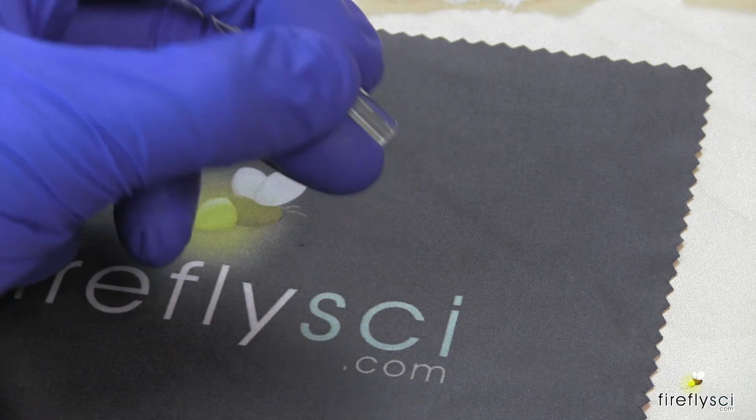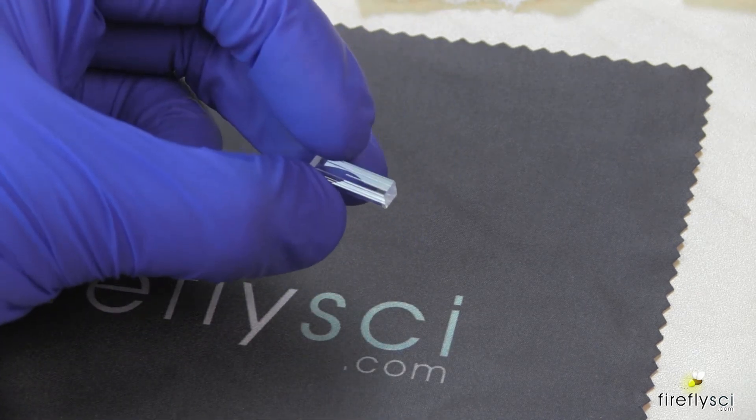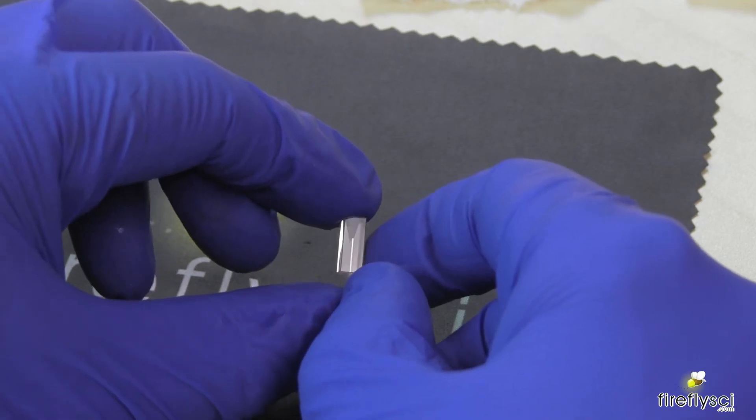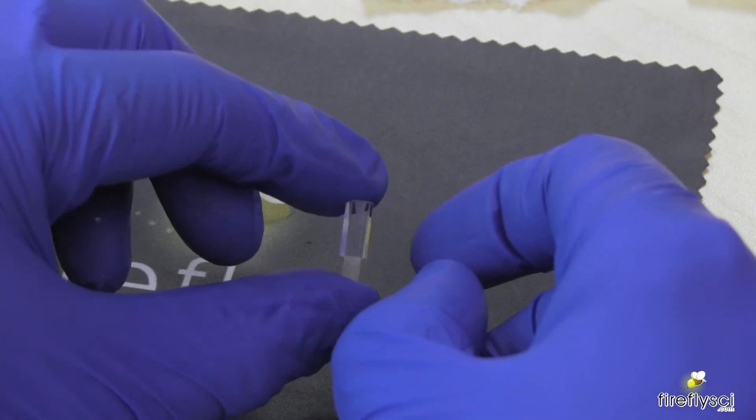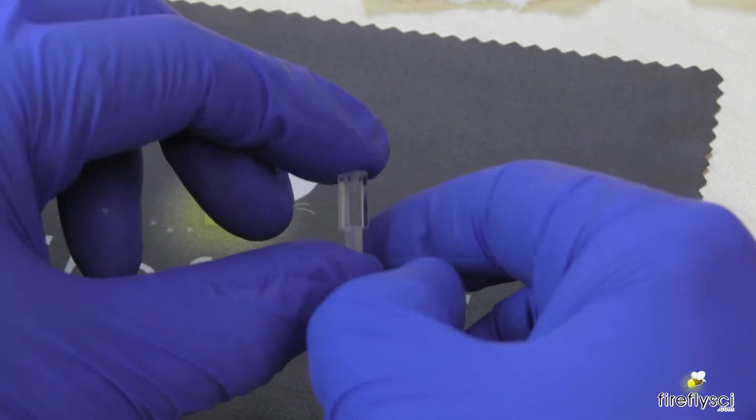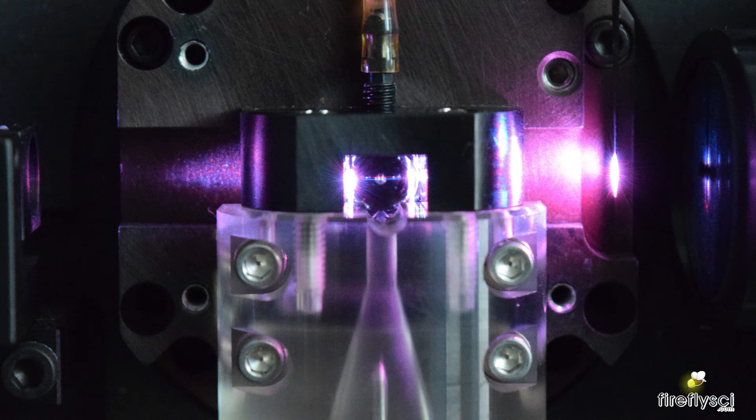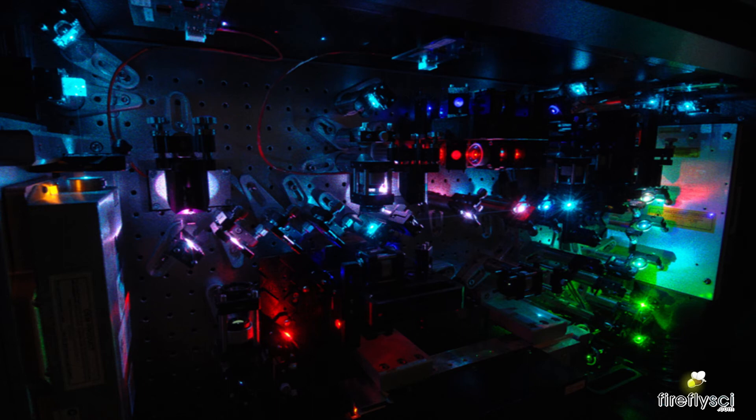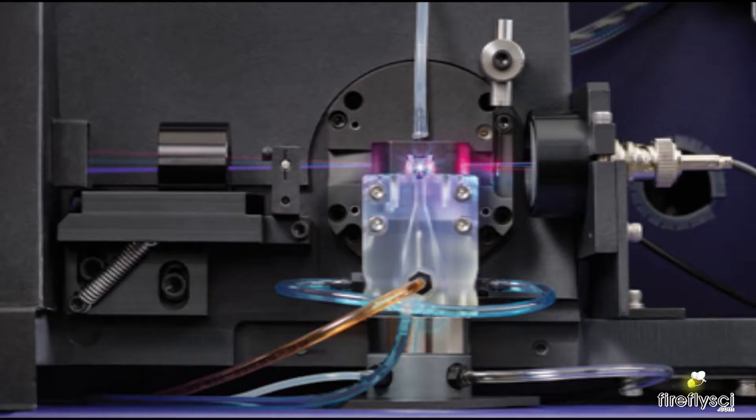Extreme precision is needed to make these flow cells correctly. The inner flow channel and the outer walls must be optically clear. All flow cells have all four walls polished. This is to allow all the different types of optics, cameras and detectors to be able to see the sample flowing in the cell. The optical faces must be extremely flat because a lot of the time there are multiple optics that are looking at the flow cell from all different sides.